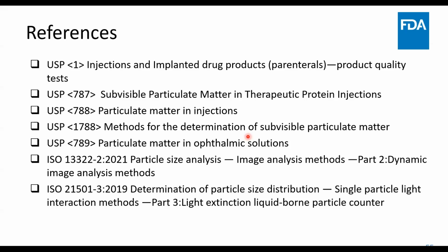Janet and Sherman, okay, what is the optimal volume of sample? You could go as low as 150 microliters for flow imaging, based on the configuration of your syringe and your pump system. If you want to use the automated system where you have a robotic system running it, then you're looking at about 1 to 2 ml of sample. But because of the cost of products such as biologics, recent advances allow you to use as low as about 200 microliters for analysis.